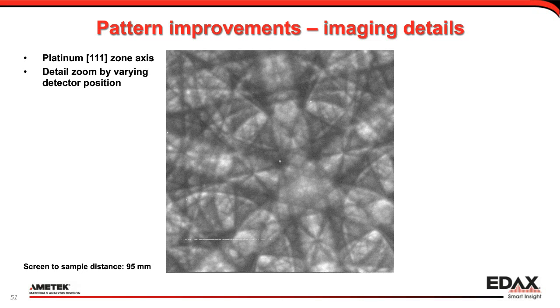But if you look close, you can see the band from the center top is showing like an arrow point on this circle, and the one to the right, coming in from the right, you see like almost a half moon shape bright band here. And that really shows the threefold symmetry in the details inside the band. You can also see it in the Holz rings that are present on the top, the bands from the top, from the lower right and the lower left. And the other three bands don't really have this circle available. So there you can really see the details in the bands.